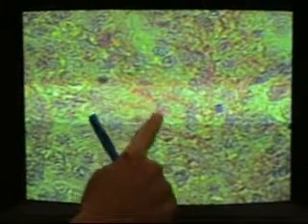What slide is this? We're in the spleen. Oh, this is the spleen. This is such a thick section. I never liked it very much because of its thickness. But if I move the fine focus a little farther away with the oil objective, then you're going to see in this area the red fibers. The red staining is the basal lamina, and that is where the cells are going to migrate out into the pulp cords, and this is a pulp cord area here.